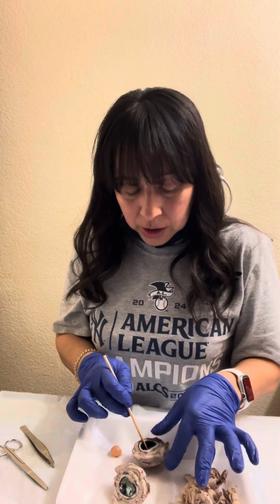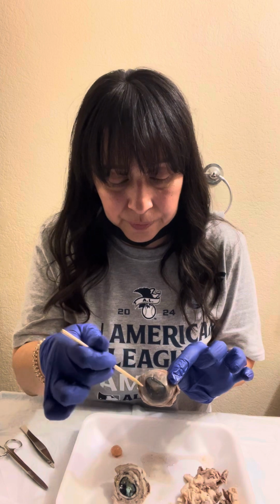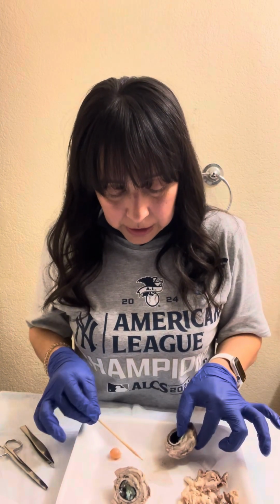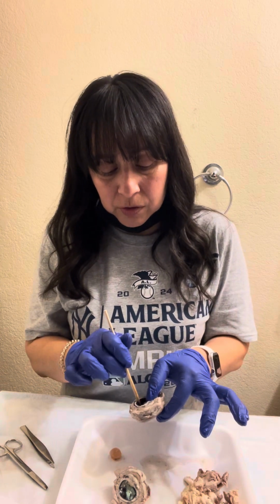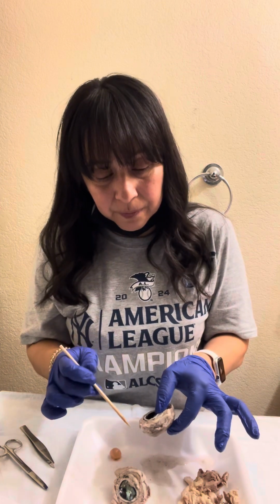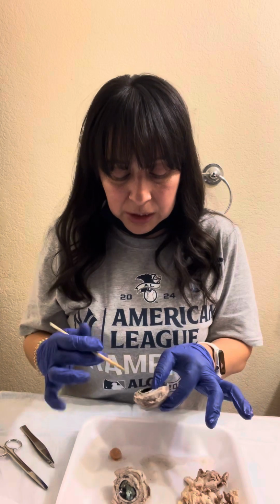The pupil is at the center of the iris. So that's this area here, right in the center. And that allows light to enter into the eye. This fluid here that is on my tray is called aqueous humor, and that's a watery fluid, and that fills up the anterior chamber or cavity, and that nourishes the eye and helps to keep the eye's shape, the roundness.